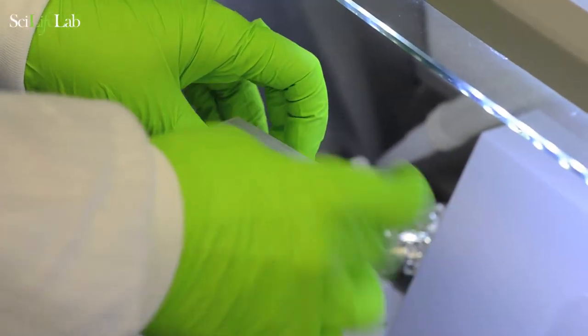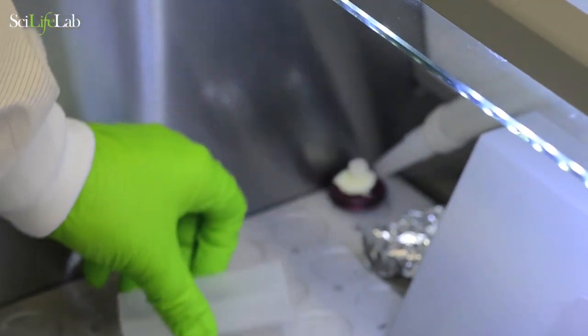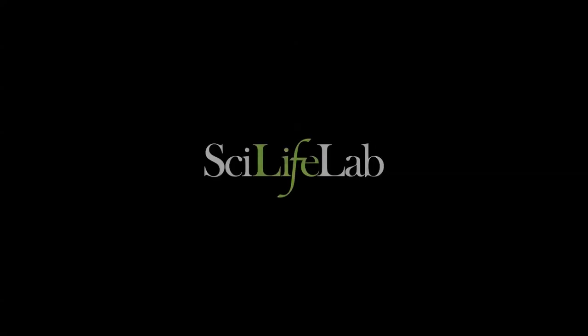You can freeze your glass slide at minus 80 for later processing, or continue directly onto the ST protocol.